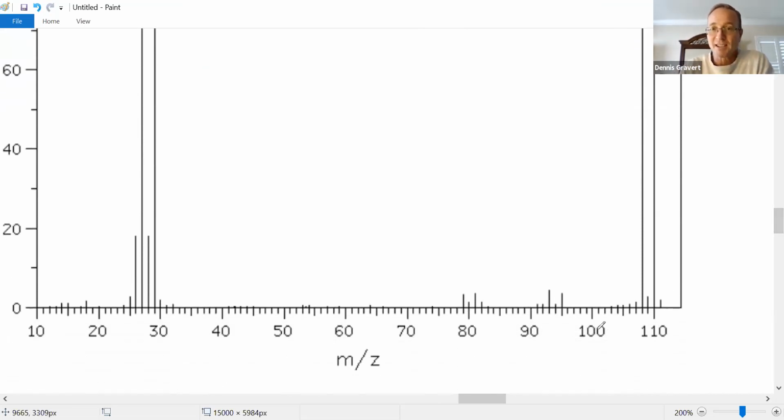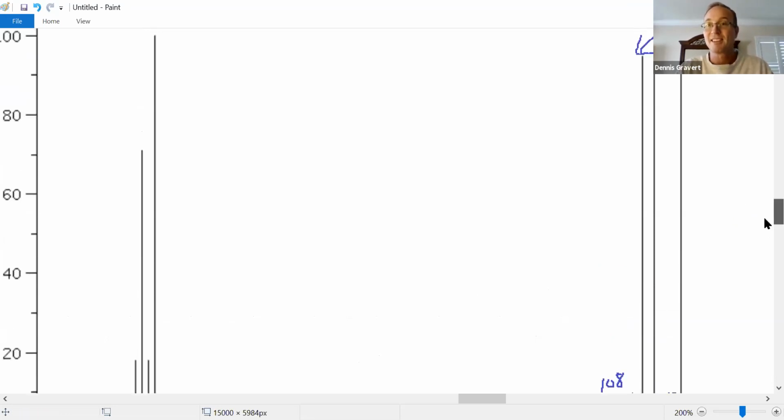So this is nice. We're seeing individual tick marks. So this is 110. So this one's 105. Yeah, so every marking is 1 unit. So this is 106, 7, 8. This is 108. That's 109. And this one is 110. They're 2 mass units apart and they're twins, right? They're nearly the same height.